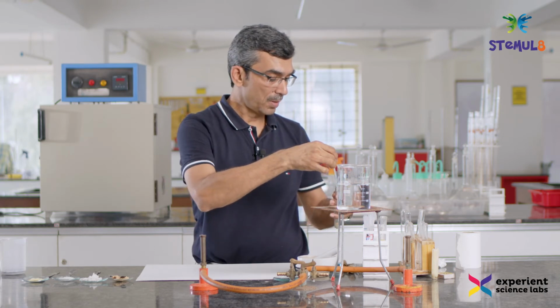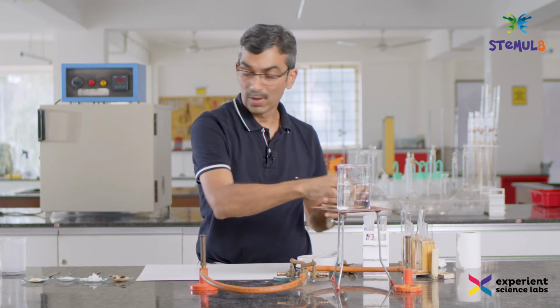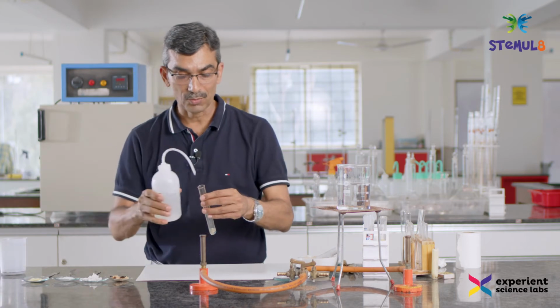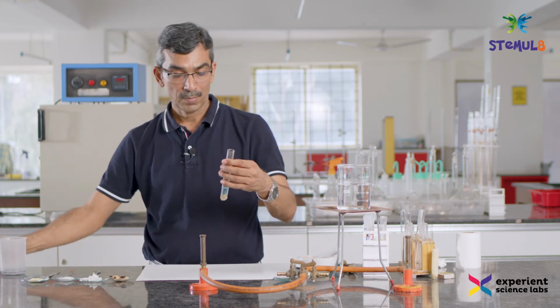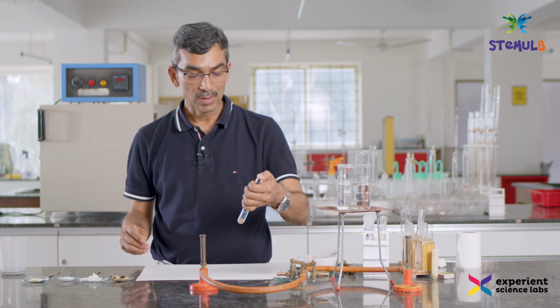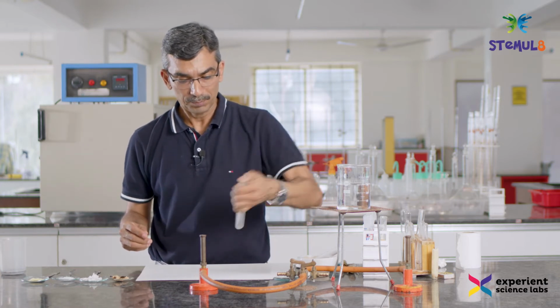I just added maybe 1 and a half ml of biuret reagent, a bit of water to it, and I will just try to mix it.